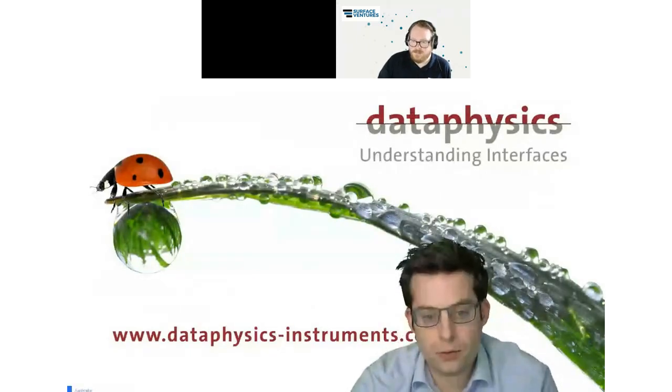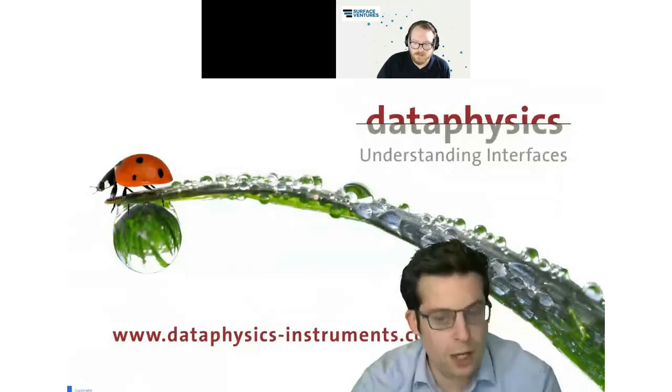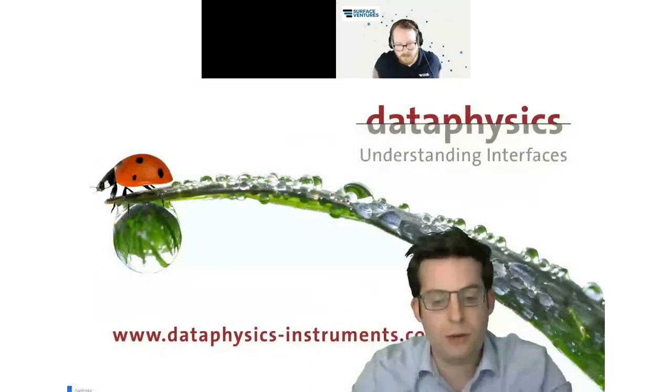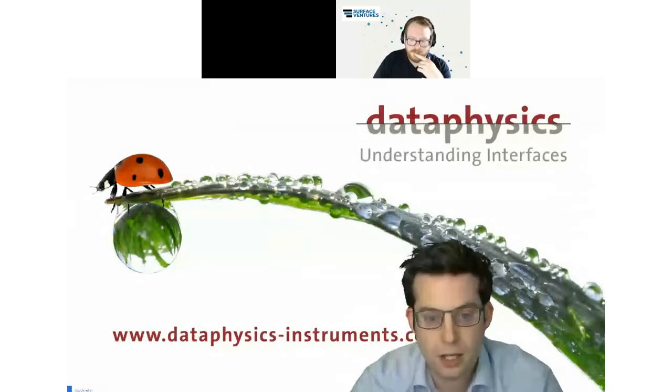So a contact angle of 0 for super hydrophilic surfaces is real, and can be measured and can also be seen. A contact angle of 180 degrees would mean that, if you zoom in completely, there would be 0 contact with the surface. So I think this is not realistically happening.